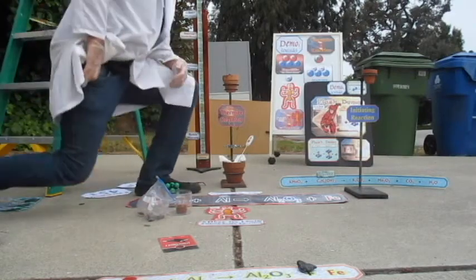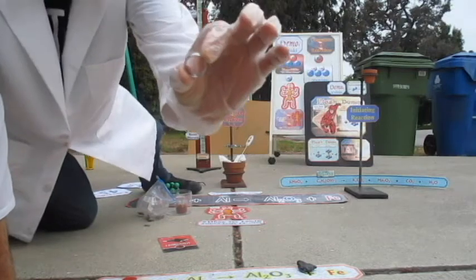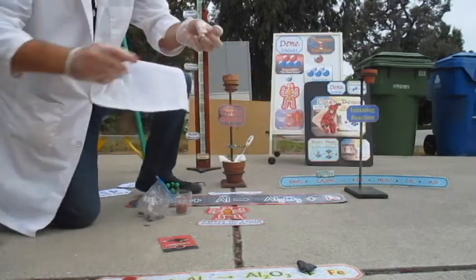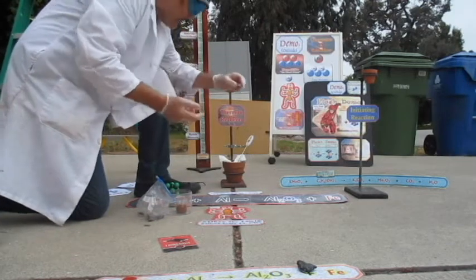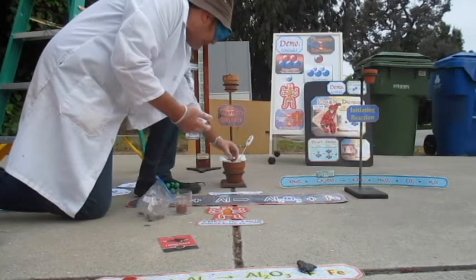Because, remember, one ring to rule them all, one ring to find them, one ring to bring them all, and in the darkness bind them. I think I misquoted that. Anyway, Lord of the Rings. So in honor of Lord of the Rings, I'm going to put a little piece of platinum in here. This will probably be okay. We'll see if it melts the platinum. I'm going to put it next to the ionic compound.